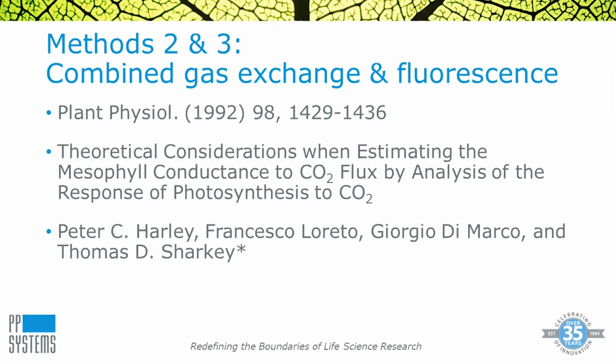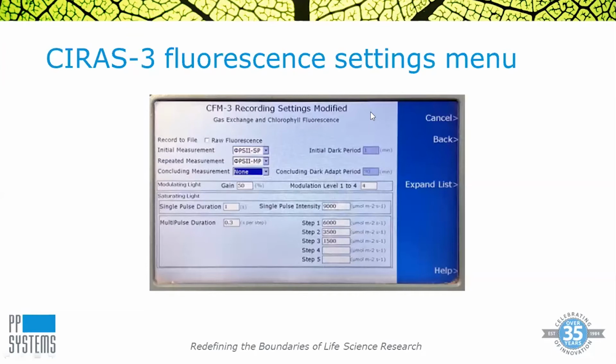They developed two different methods combining gas exchange and fluorescence to estimate mesophyll conductance, and we'll go through them separately. But first, on the CIRAS-3 fluorescence settings menu, the fluorescence measurements you need for these two methods are both fairly simple.